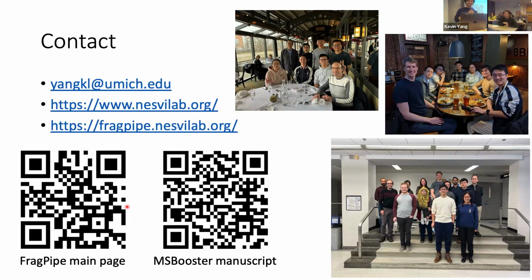You mentioned the DIA-NN model to start was closed and you just used it as is, and then you said you switched to these open models. And then you talked about fine tuning your specific set, but I missed at some point, how specific are these models for the specific application? What are they trained for, and is there a mismatch between what they're trained for and your application? What DIA-NN's trained for, or just generally? I mean, the newer ones.